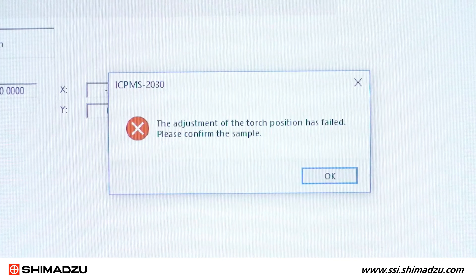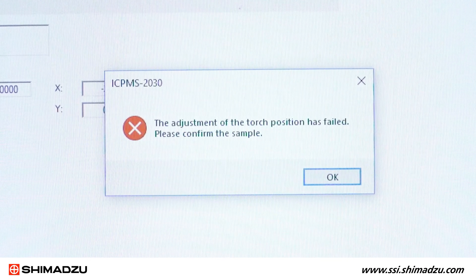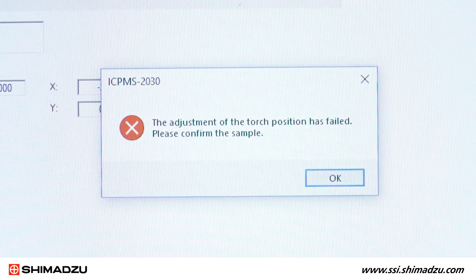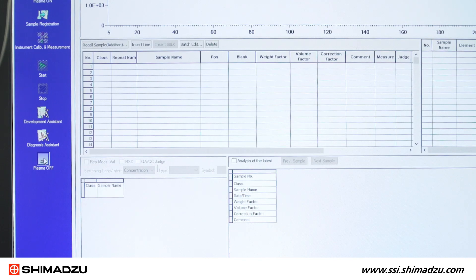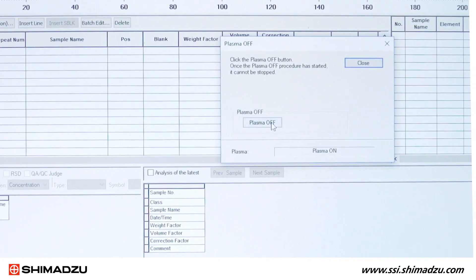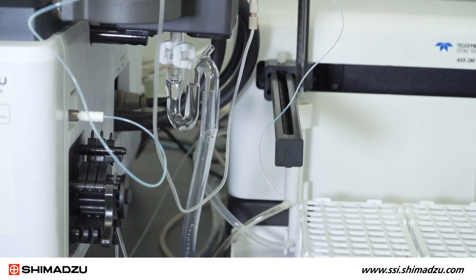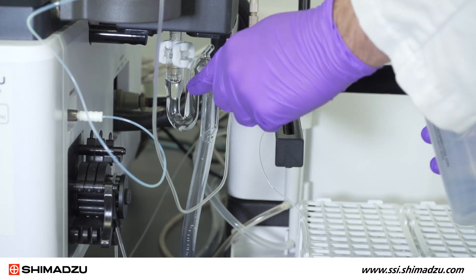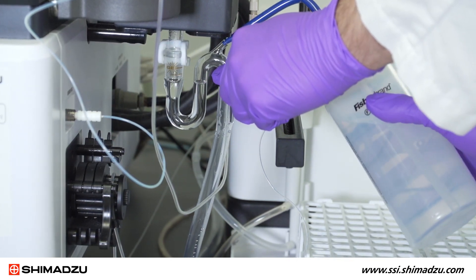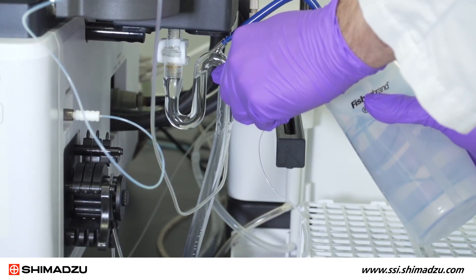You may notice this issue when you run a tuning solution for instrument calibration. To begin your troubleshooting, first check the drain trap to make sure it is full. If it is not, you should fill it with deionized water.